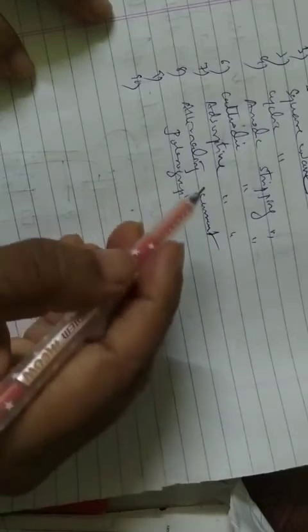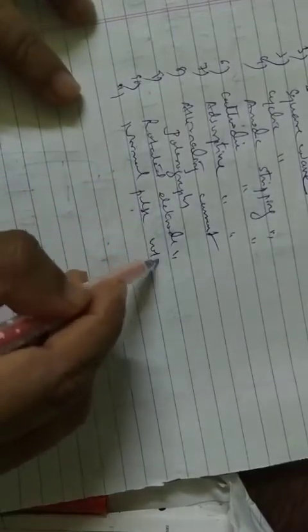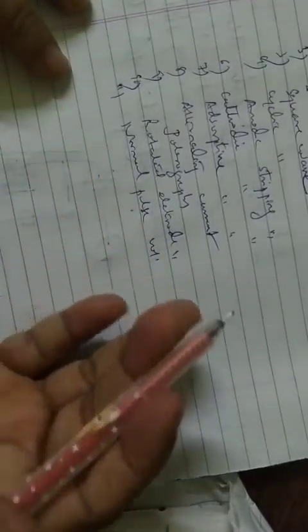Even there is rotated electrode voltammetry, normal pulse voltammetry, and even differential pulse voltammetry, and so on.